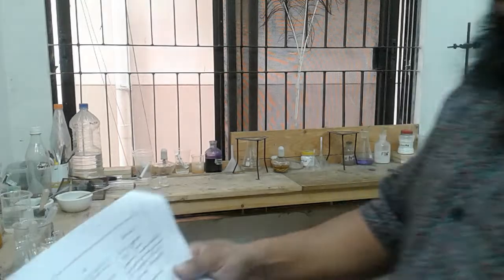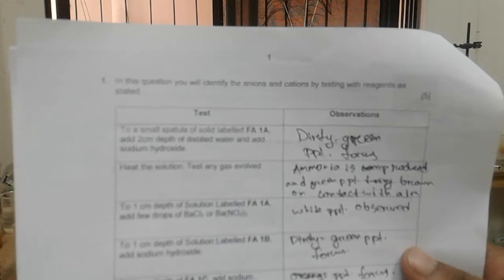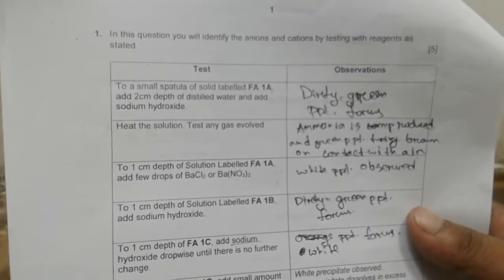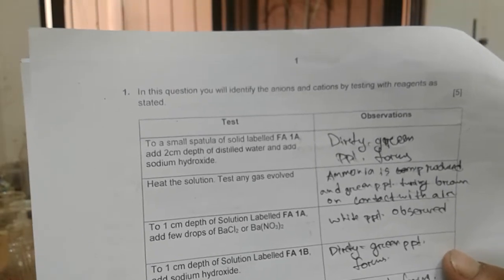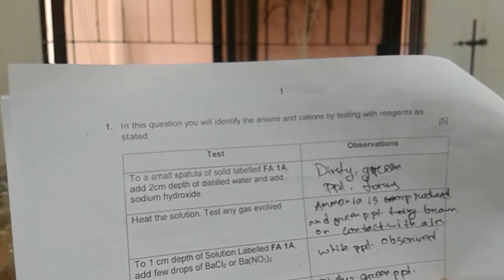Okay, so the first question asked you to identify various anions and cations by testing with reagents as stated. So here the reagents are stated and you have to do the practicals. To a small spatula of solid labeled FA1A, add 2 cm depth of distilled water and add sodium hydroxide.